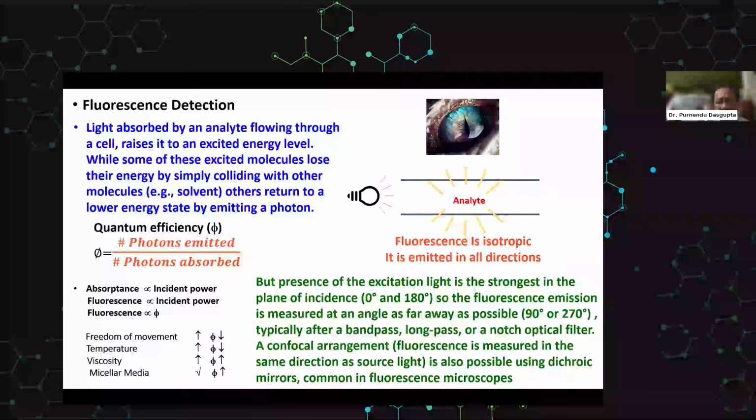Let's talk about fluorescence detection, and we'll hopefully come to an end quickly. We all know that it absorbs light. Fluorescence is when, instead of generating heat, you shoot out another photon of lower energy, and you detect it typically at right angles. How good it will be depends on how fluorescent it is. That means the ratio of photons emitted to photons absorbed.